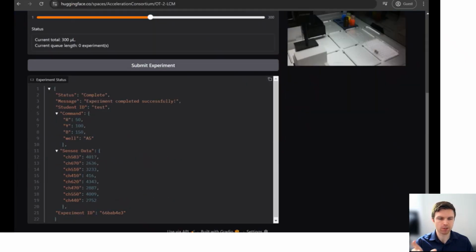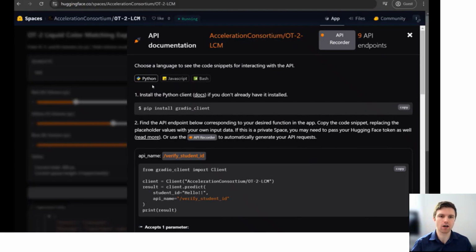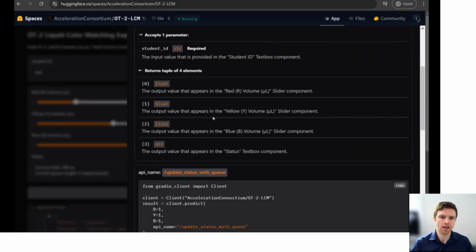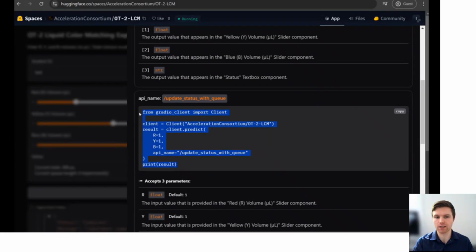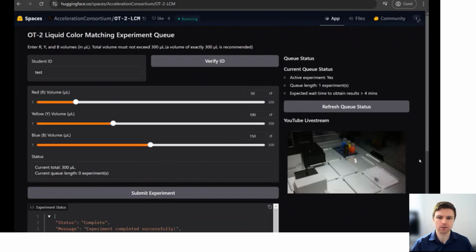And we skipped a little bit here, but on the bottom left, we get that color measurement data. And this kind of system can also be called programmatically with an API. And in a course, self-driving labs for materials, taught by J. Hattrick-Simpers this last semester, there were about 18 students who accessed this piece of equipment remotely and asynchronously, and in total conducted well over 1,000 experiments on this.